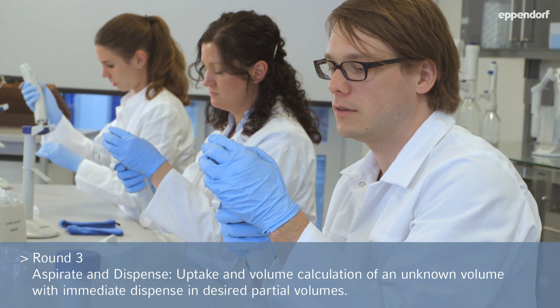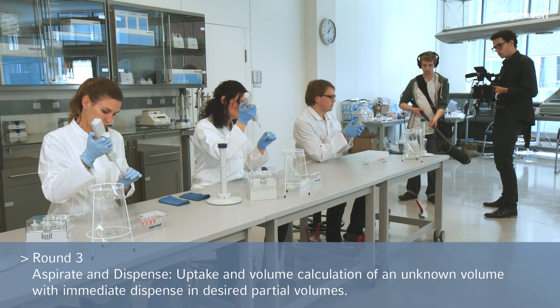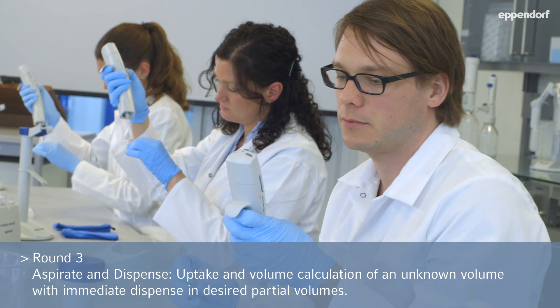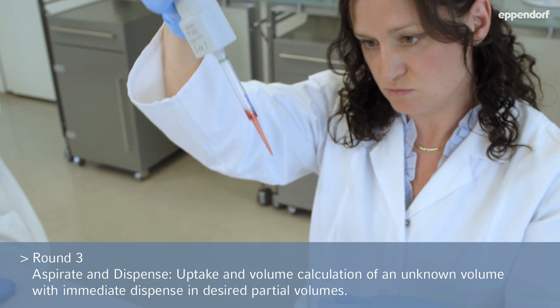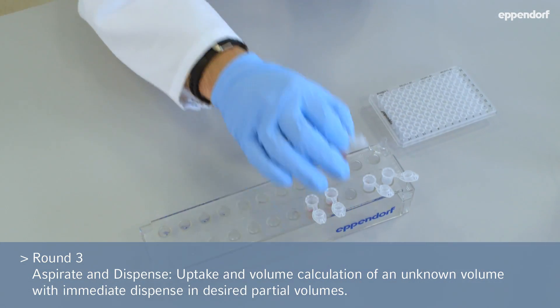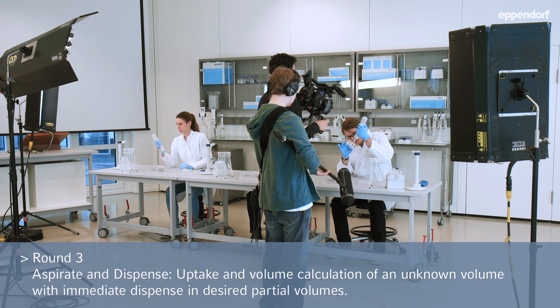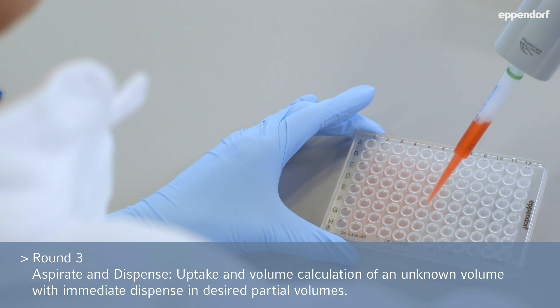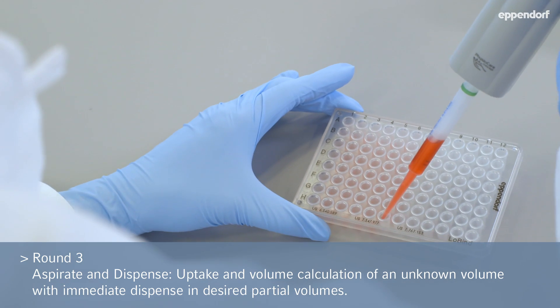So let's see how aspirating and dispensing works. Press the button. The display guides you through it very well. I don't even have any air bubbles. That's great. Speed one is very convenient with these small volumes. No effort is required to press this button. It's not strenuous at all.